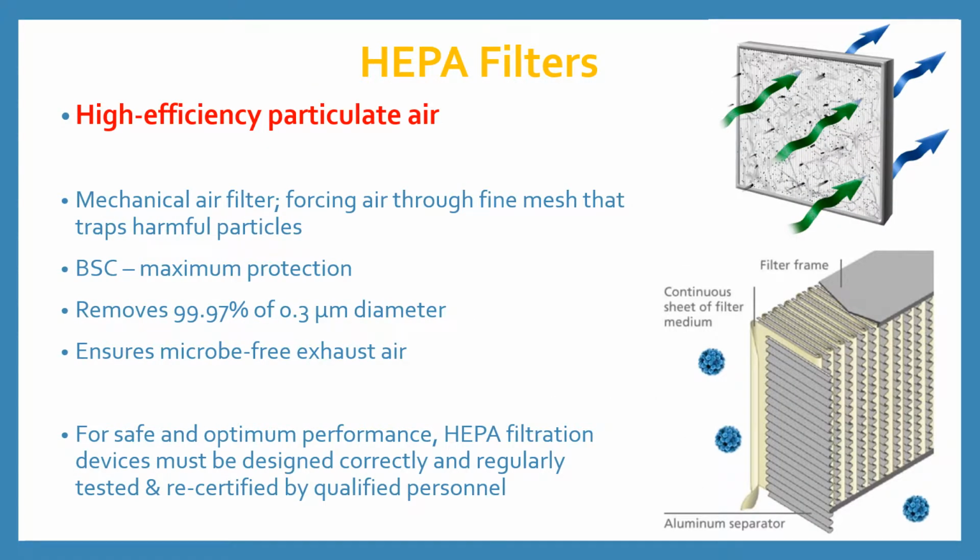HEPA filters. HEPA stands for High Efficiency Particulate Air. It is a mechanical air filter that forces the air through a fine mesh that traps harmful particles. As shown in the image, it consists of a thin, continuous, pleated or folded sheet of boron silicate microfibers with aluminium separators. Biosafety cabinets with HEPA filters provide maximum protection.